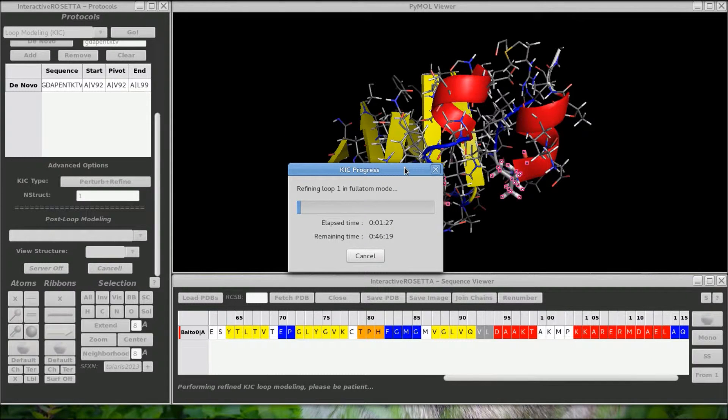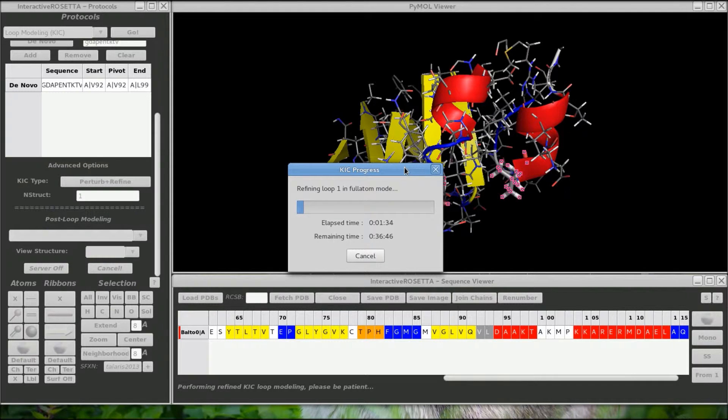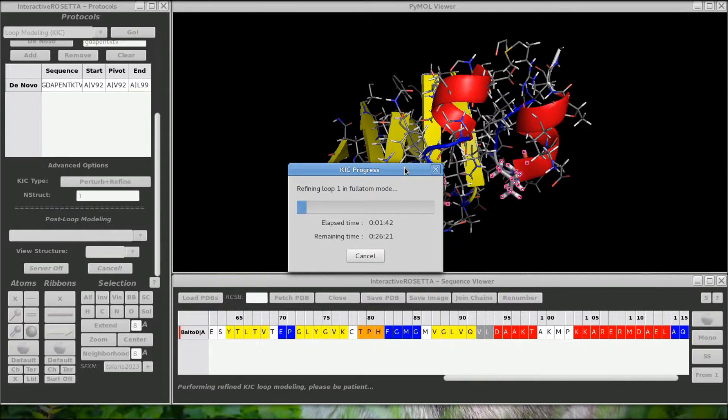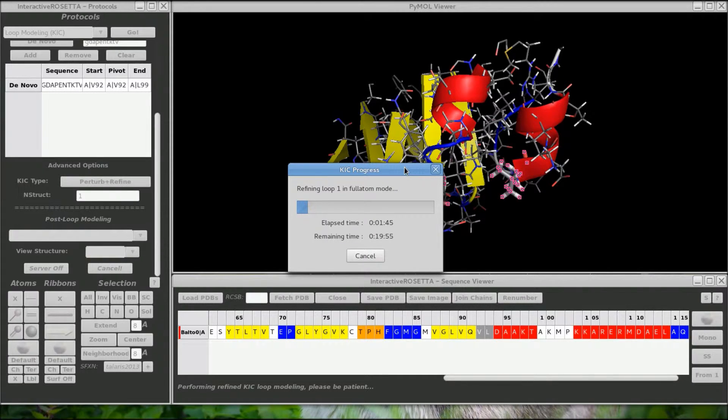There it goes, the time estimation is off in the beginning because it includes the low resolution step as part of the first update. So it thinks that every update will include the low resolution step. As it goes along, the time estimation becomes more accurate. This process takes about 8 minutes, so I will see you in a bit when it is finished.